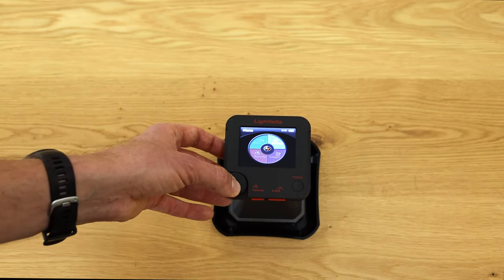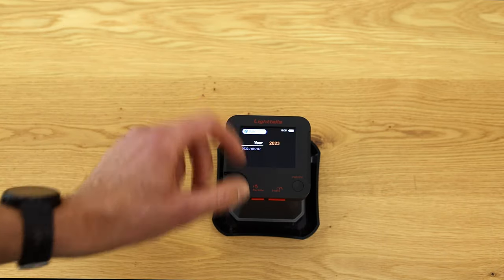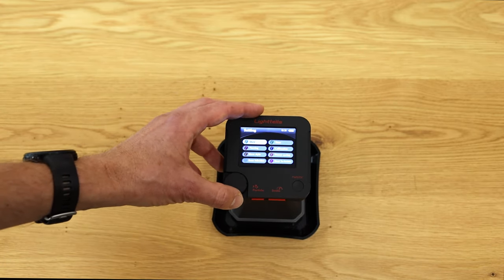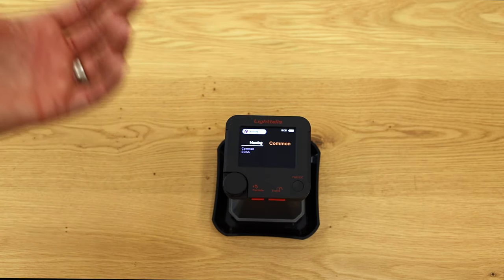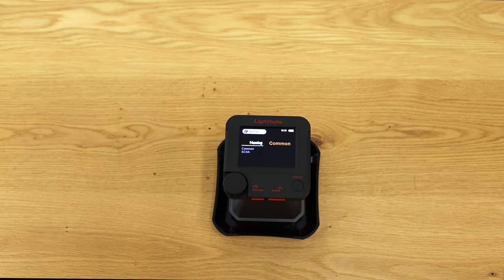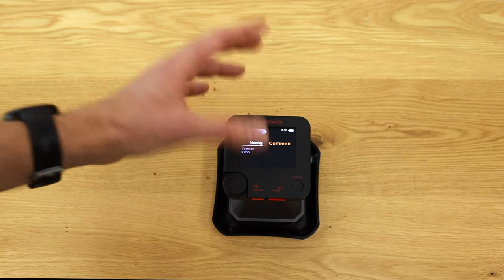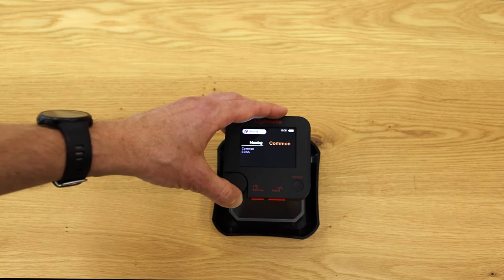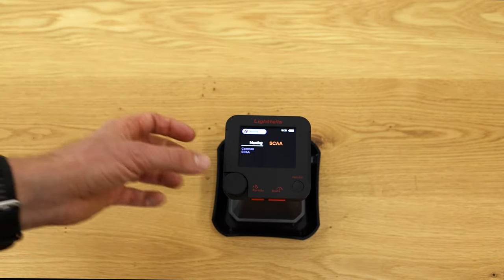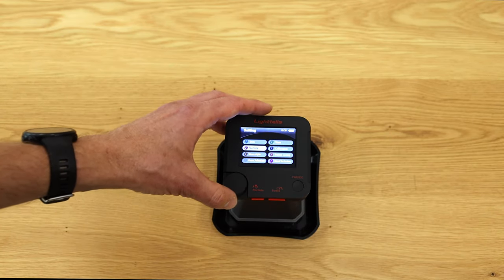Now into Settings. Here you can set date and time so that measurements are accurately timestamped in the device. The device gives precise color values but also provides descriptive wording for roast levels like 'light' or 'dark.' You can choose between SCAA naming or another common naming convention for these descriptions — not critically important, but useful.